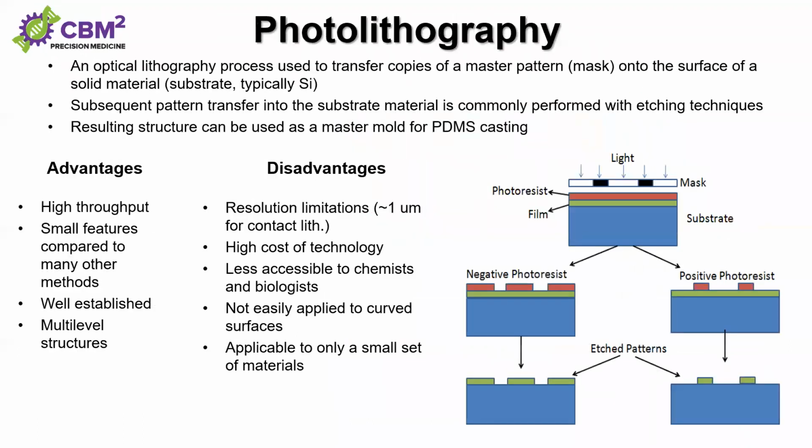So these are some advantages and disadvantages. This is a parallel patterning method, which is different from the micro milling you have seen before. In micro milling, the needle drill just scans over the area where you want to make patterns. But in photolithography, once we have this mask, you shine the light through the entire area of the mask at once. So this is a parallel process and high throughput.